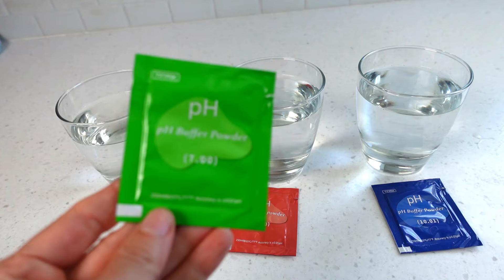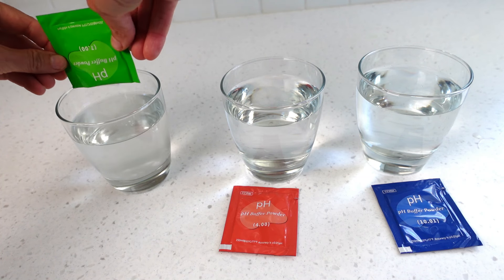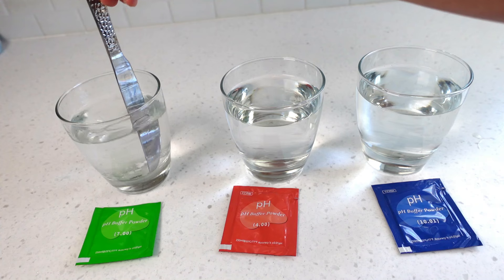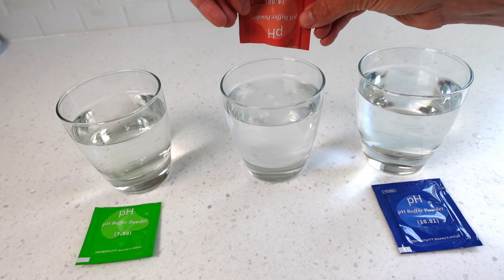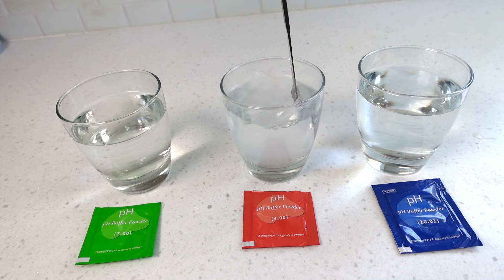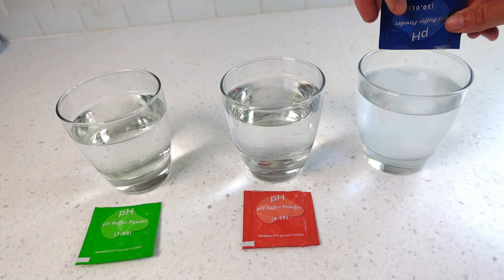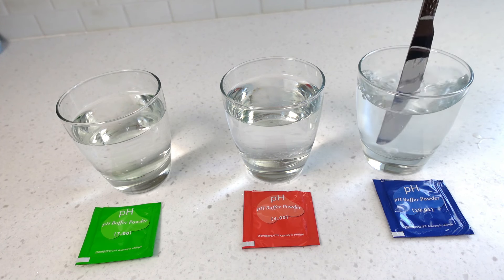Empty the contents of each packet into their designated container. Stir to dissolve the solution into the water — this may take over a minute for each one, so have patience. Perform this complete calibration process before the first use of the meter. Calibration must be done with these exact pH buffer powders of 7.0, 4.0, and 10.01. You cannot use other buffer solutions that have a different pH, even if they're close. The device is not programmed to calibrate correctly using mismatched pH buffer packets.